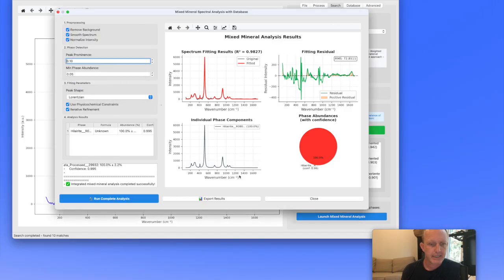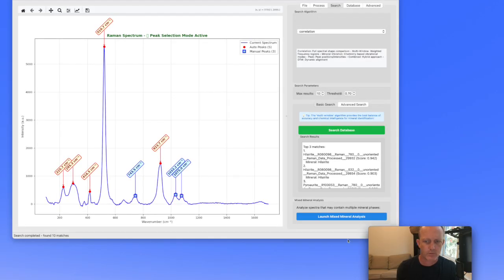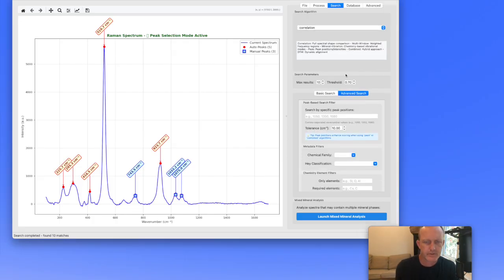Yeah, so anyway, this is a work in progress. It's getting closer, but it's still a work in progress. And now there are some options for advanced matching. So if you go here, it's very similar to the basic matching. The first thing you get to choose is what kind of searching you're going to be doing. So this is important. You want to make sure that whatever search algorithm you're going to be using matches what you want to do down below. And you can mix and match these things.